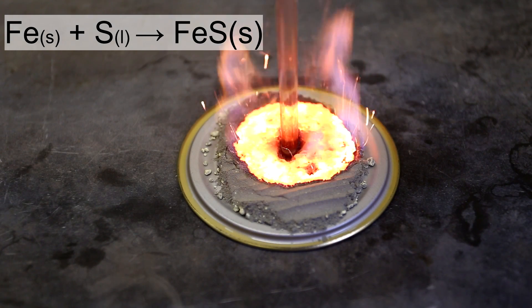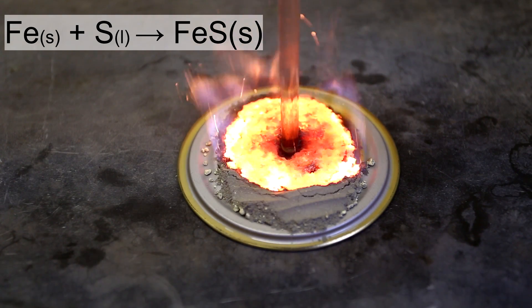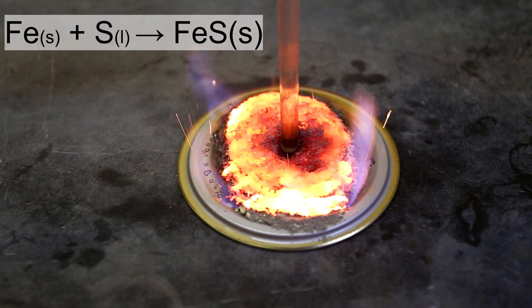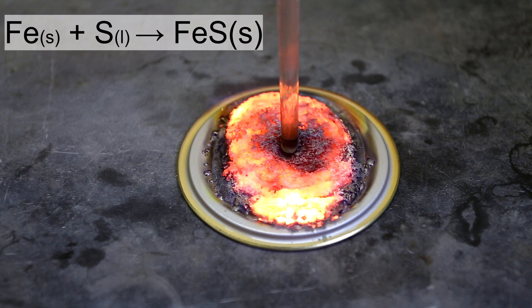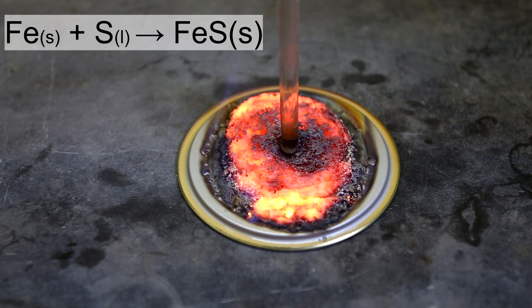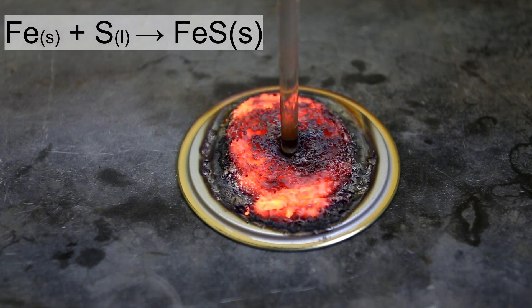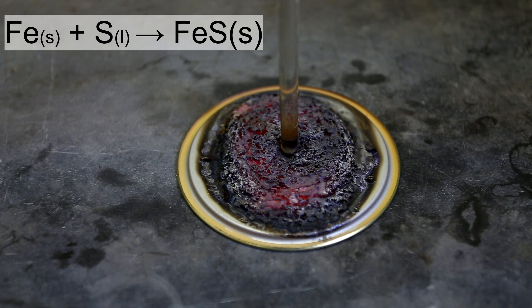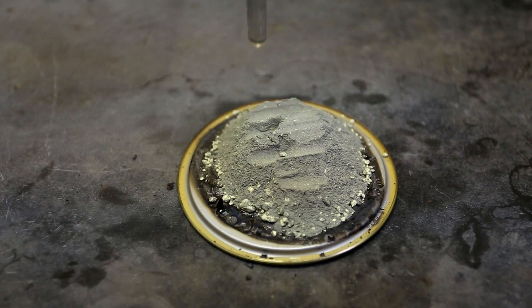This reaction should only take place on something that can withstand the high heat. This means it should be carried out on something like concrete or a high melting point metal. Not aluminum, because aluminum will melt at around 600°C. Also, absolutely no glass, porcelain, or organic polymer of any kind.